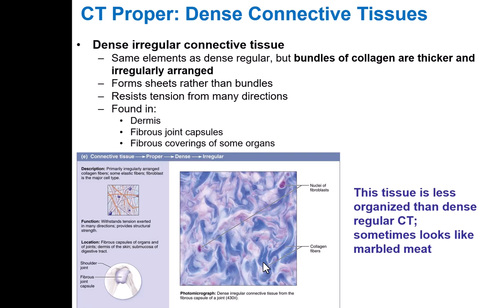But how do I know these are collagen fibers? Well, I know they're not cells because you would see a defined nucleus if it was a cell. So that tells me right away, okay, I'm looking at a connective tissue because I'm seeing something else. So chances are it's a fiber. Collagen fibers are thicker than the other two, and they don't have super sharp defined edges.